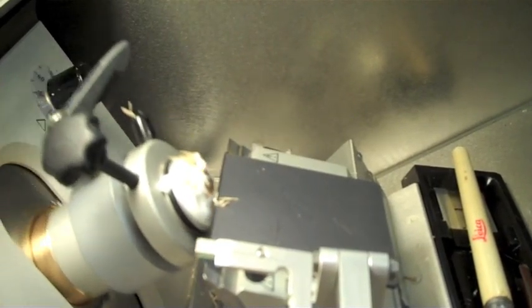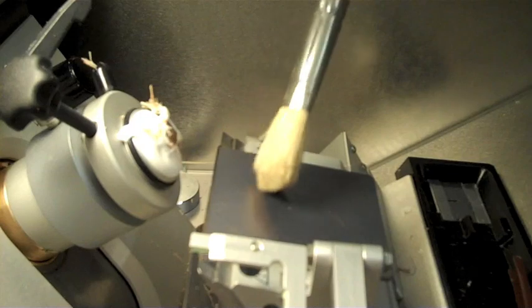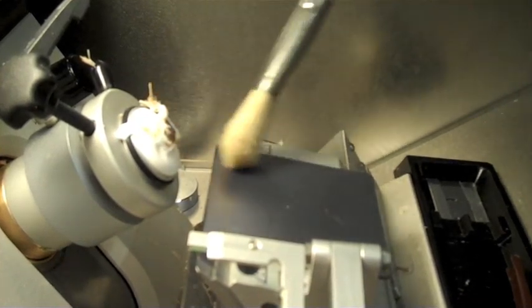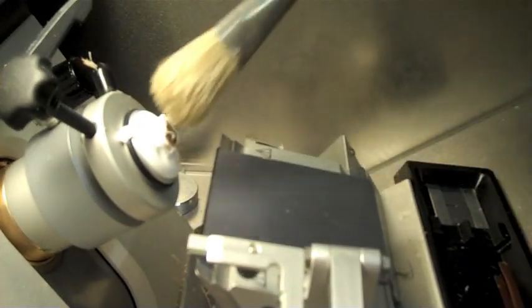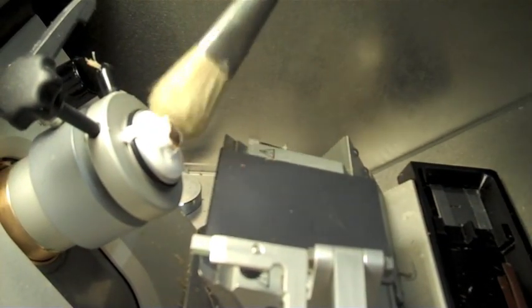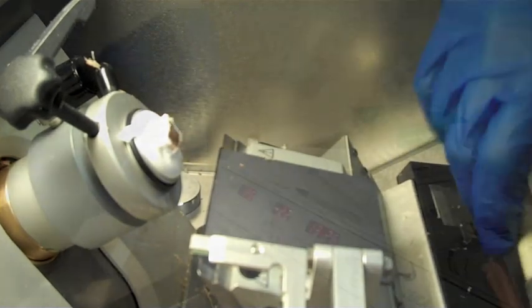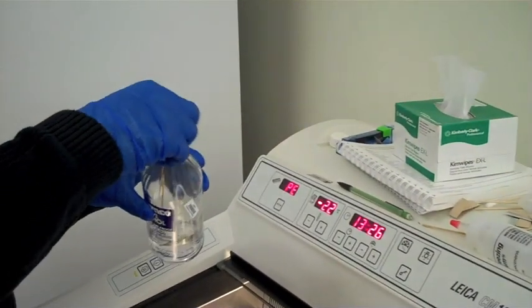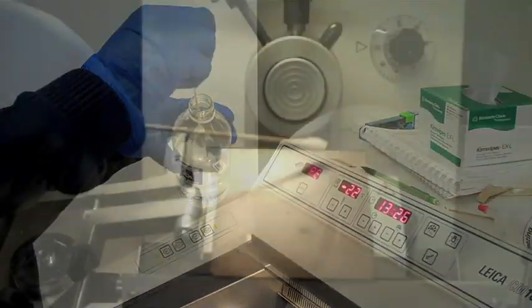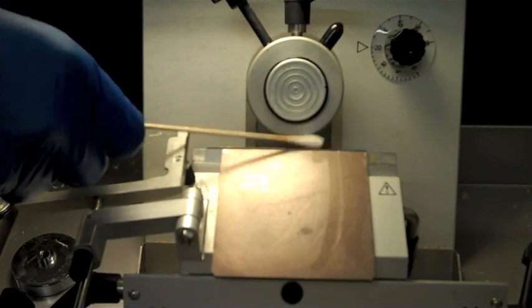You are now ready to begin fine sectioning. Clear the blade and the specimen of debris with a brush. If necessary, you may have to clean the blade and faceplate with ethanol.